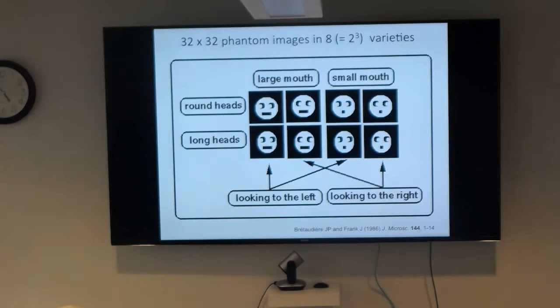So then I'll interrupt with a question. From Alex Noble's work, we have a clear idea that we don't have a very good handle on our samples. I wasn't at that GRC, but I heard that Richard Henderson was asked, what's a future microscope? And they said, oh yes, in 10 years there'll be a microscope that's 300 kV with an energy filter and a CS corrector, and it's going to cost $10 million. And now that's reality.